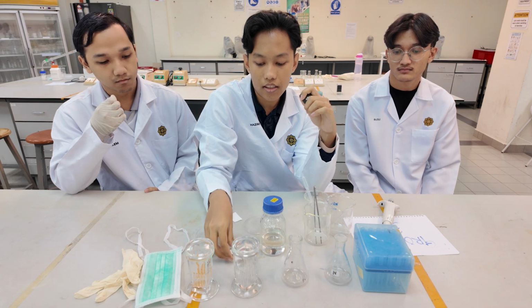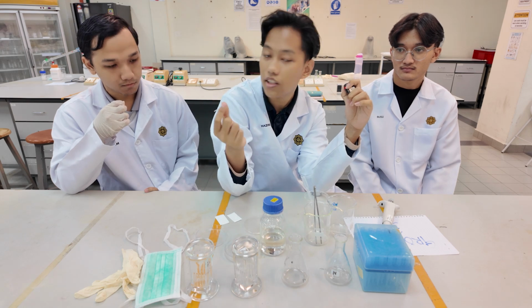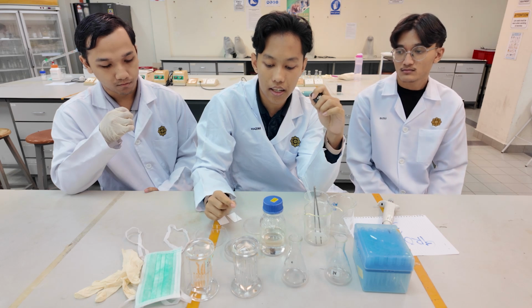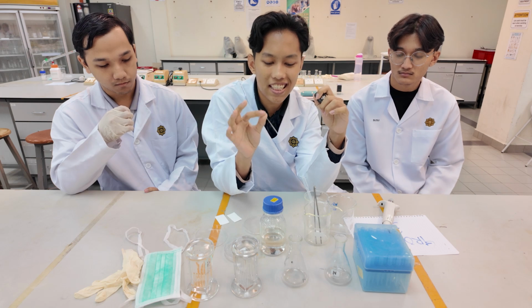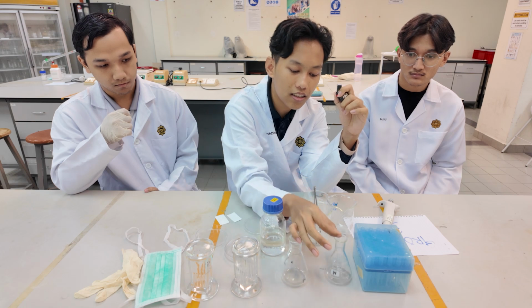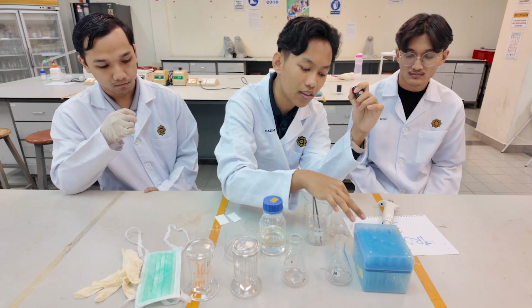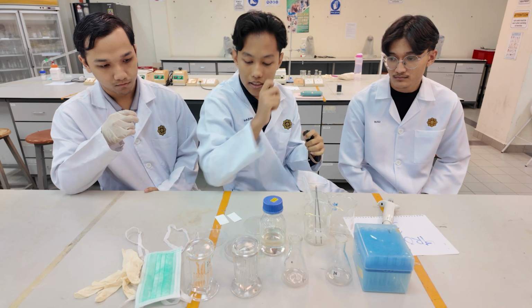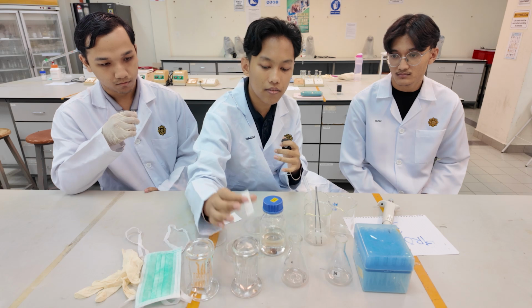Next, we take the capillary tube for spotting on the TLC plate. We use a capillary tube because we need a very little amount of acid, base, and neutral to spot on the plate. We take only a little bit and spot it for acid. Next, we use another capillary tube for base and another capillary tube for neutral. Then, done. Next, we put the plate inside the developing chamber.